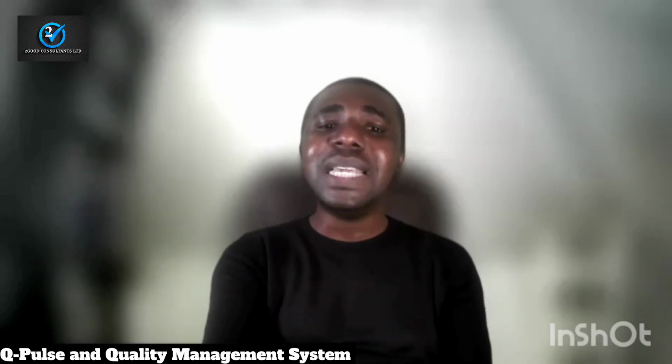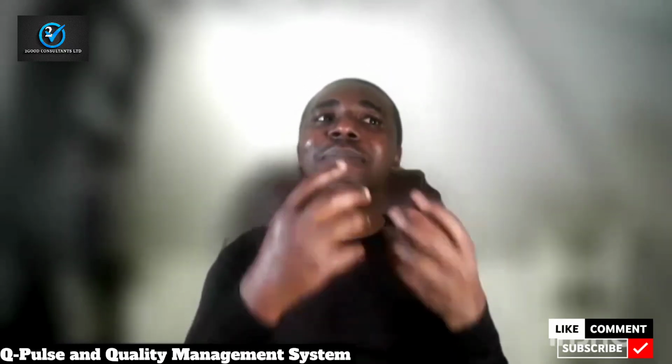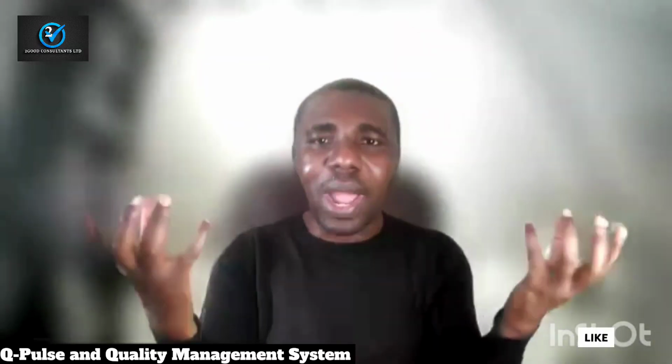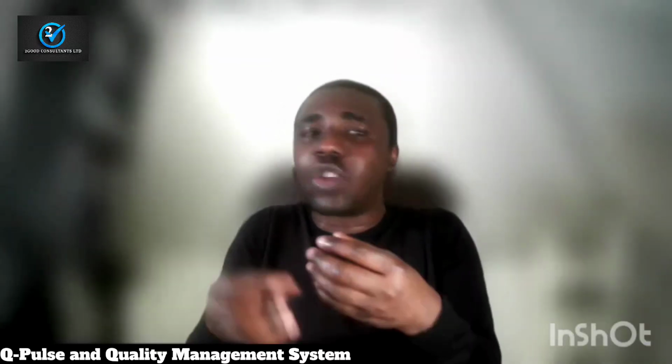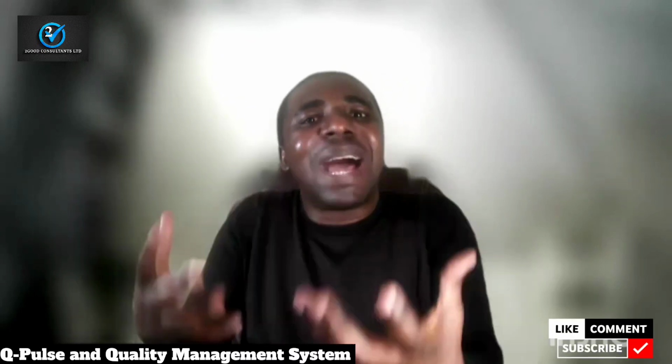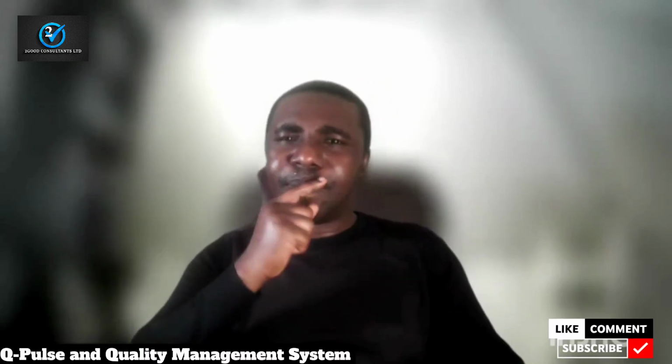That is the essence. Now, remember that it is a software. It is not a quality management system as it were. What it does is that it is supporting the managers, let me use that word, to be able to carry out their work. Let me give you an example. I don't want to speed run this.